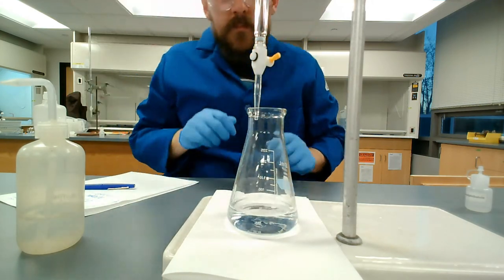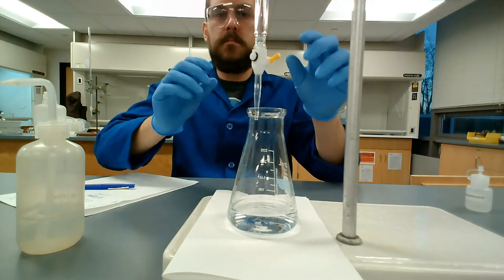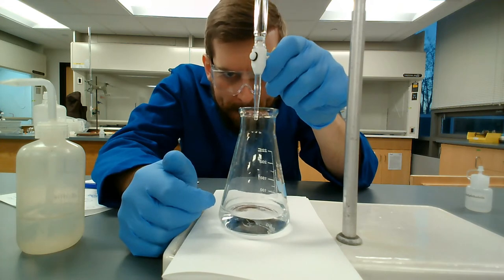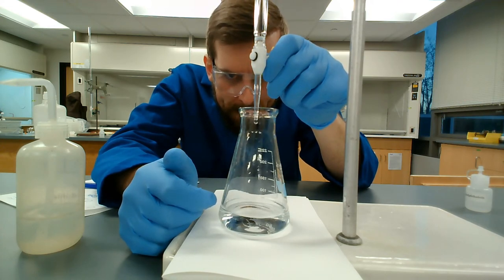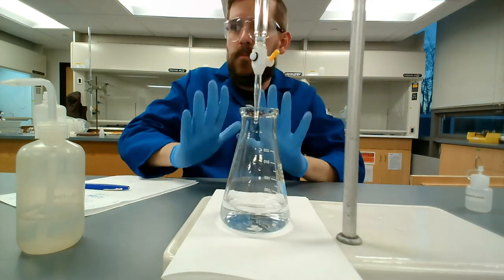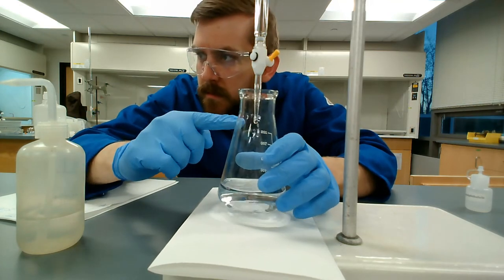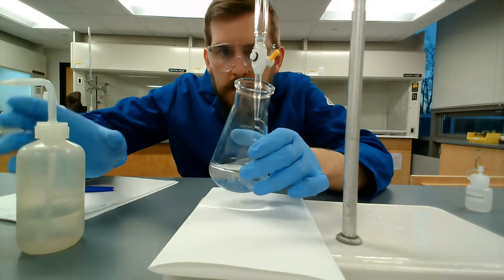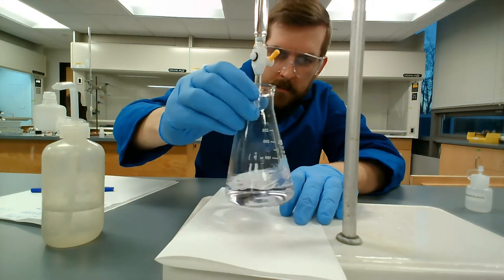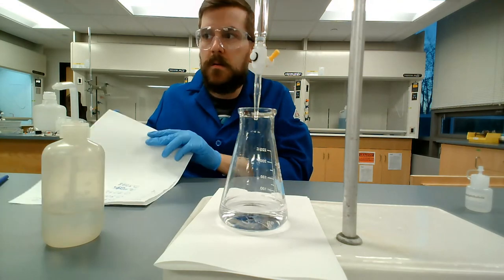It's still not pink. I think it's getting close though. So I'm going to add just a tiny bit more. A couple drops. Now I think there's pink, and I've got a little drop on the tip, so I'm going to, again, tap that to the side of my glass and rinse it in. Give this thing a swirl. And it looks very faintly pink at this point in time.